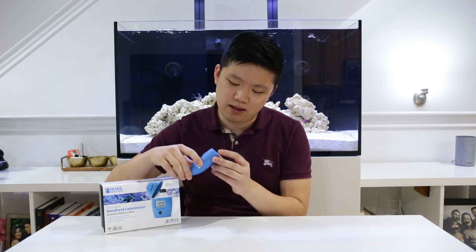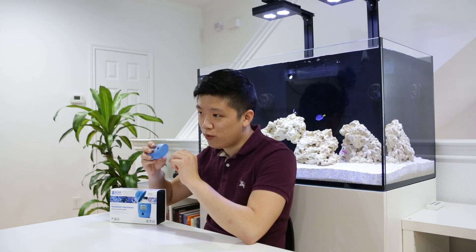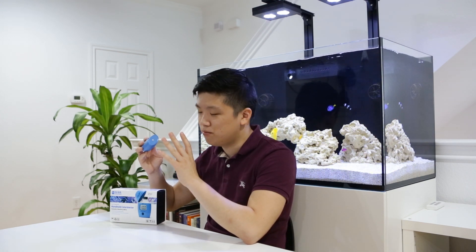The only thing I don't really like about it is the battery compartment on the bottom. You have to actually unscrew it to get to the battery compartment, which can be a little bit annoying. I wish it was just a pop-off cap — that would be much, much simpler.